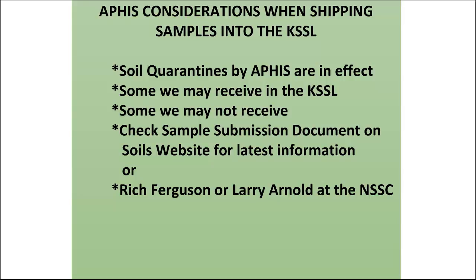So I'll show you specifically the ones that we can't receive, and I'll mention the ones that we can receive. But there is a document in the soils website. When Steve went in and showed you where the documents were for sample submission, right above there is a document that's called Soil Sample Submission Protocol for the Kellogg Soil Survey Laboratory. This is something as sample submitters that you need to really become very, very familiar with, because it does give you step-by-step, very precise instructions on who we need to contact in case their samples come from certain areas, which I'm going to identify to you here pretty soon, and how to pack the samples, ship the samples, and prepare the samples before they're shipped.